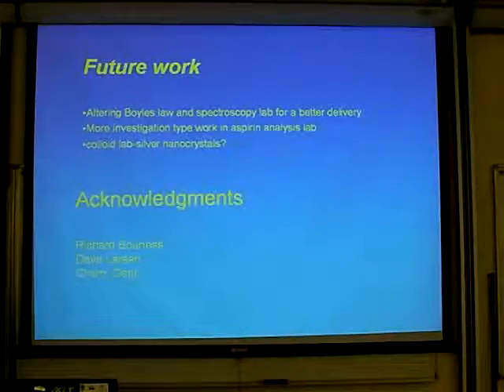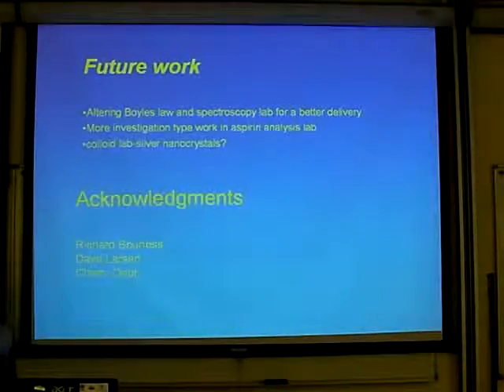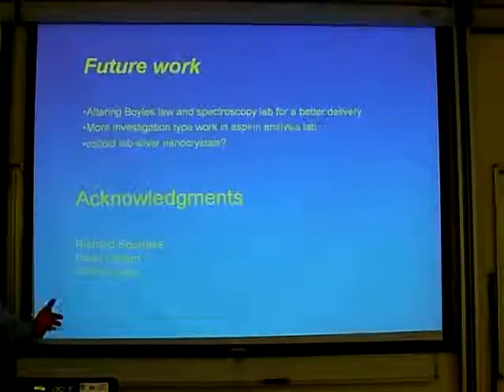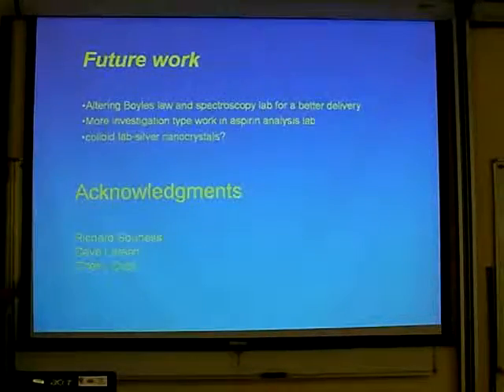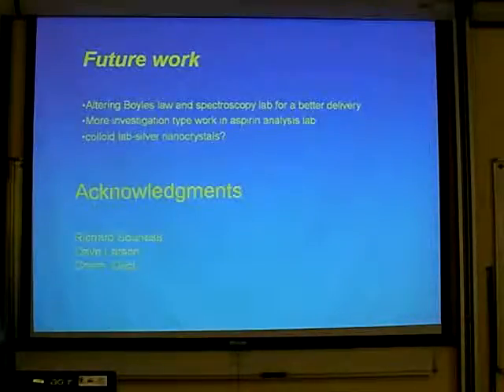More investigations at the aspirin analysis lab. I should go back to something that I should have said. The aspirin analysis lab is actually a lower level skill than you are doing at high school with your investigation 3.1. It wouldn't qualify for a 3.1 investigation. It's too simple. It's how much aspirin's in it. There is no control of anything, no patterns. Colloid lab, we've got a nice little one with silver nanocrystals we're going to try.